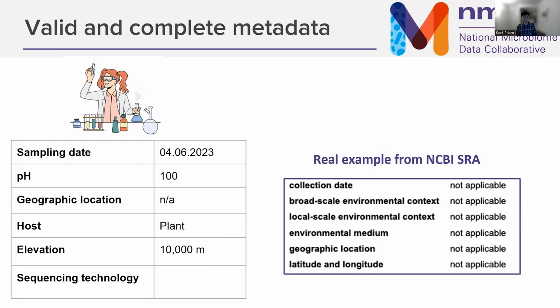So if you try to look up this data set with any of the metadata fields on the right, you wouldn't be able to find it. Also, even though they submitted a metadata sheet, it's not completely valid.